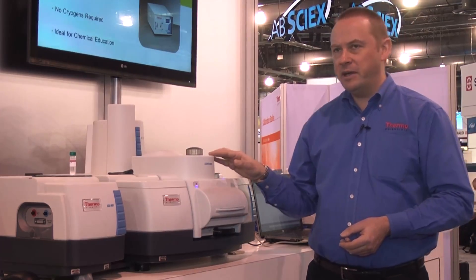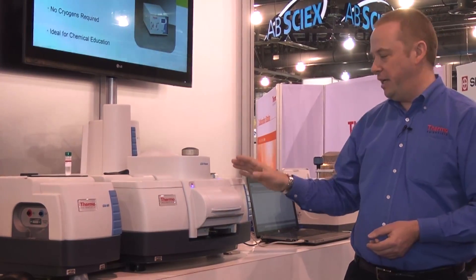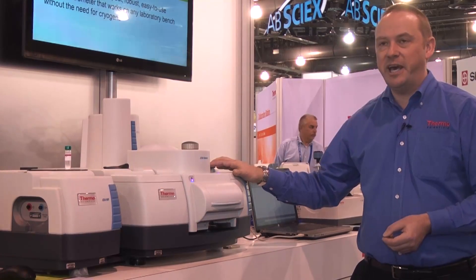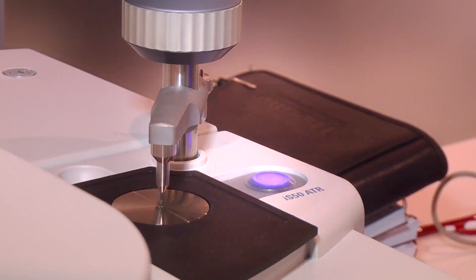With this system, however, we've integrated an ATR actually into the purged enclosure of the instrument. This means that the ATR is always ready to go, so a 30-second experiment — which is what ATR should be — will always take 30 seconds.